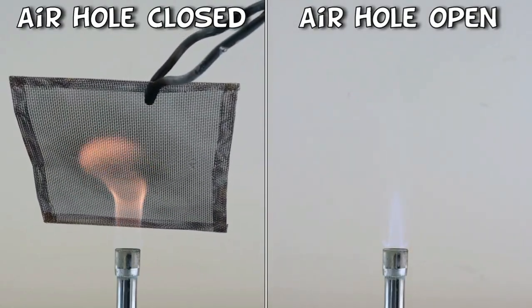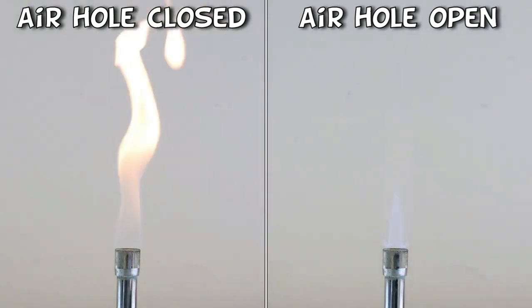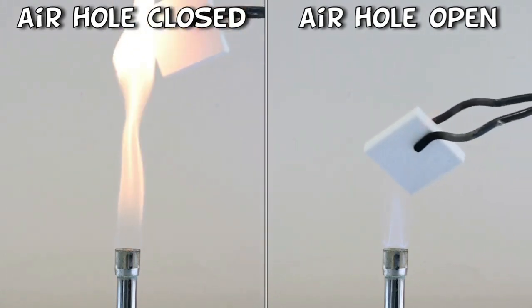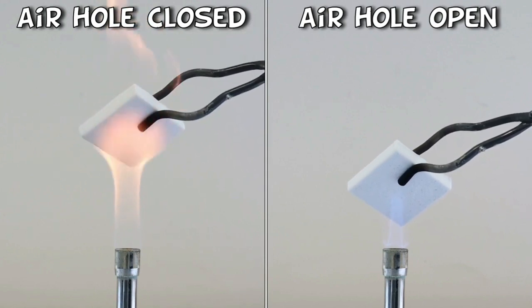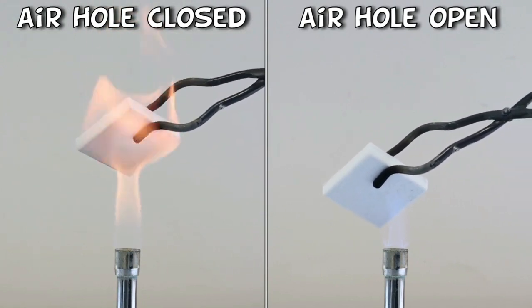Finally, I'm going to place a piece of white tile into both flames. When the air hole is closed, as it is with the yellow flame, the gas only mixes with the air at the top of the chimney, and there isn't enough oxygen for complete combustion to take place. Because of this, carbon soot is produced, and you can see this forming on the tile on the left.